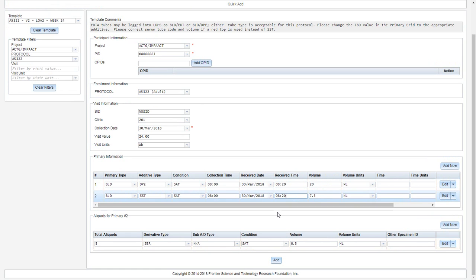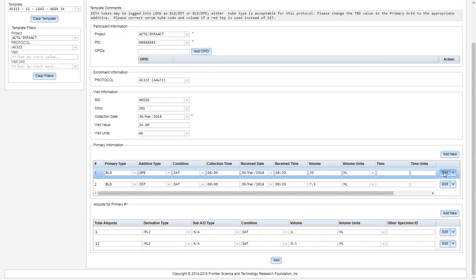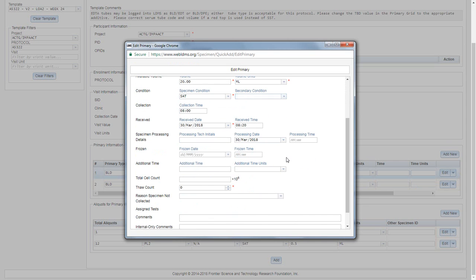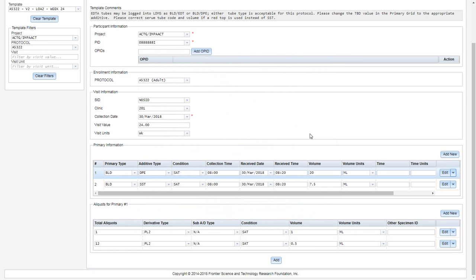If you have processing information available, you can access it by clicking the edit buttons next to the primary and the aliquots. A pop-up window will appear, in which you can then add additional information. If you do not have any processing or frozen information at this time, save the record, and please review our video on how to use the filters to find those specimens again and add that post-processing information.